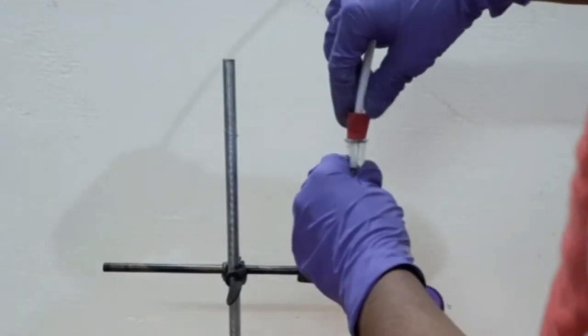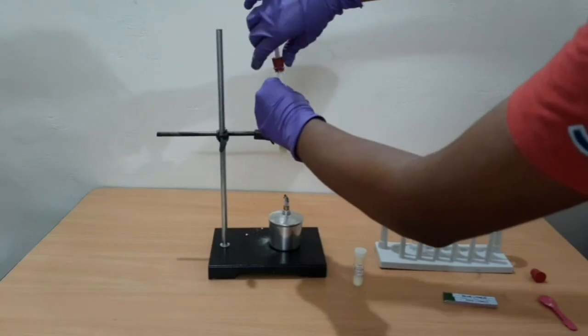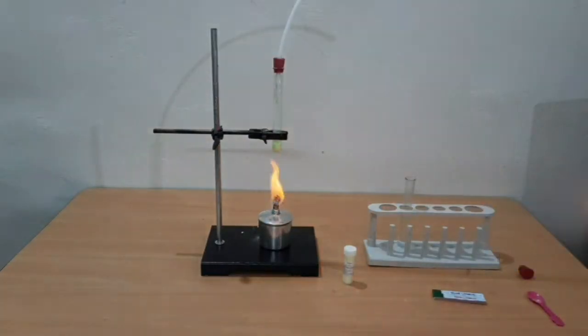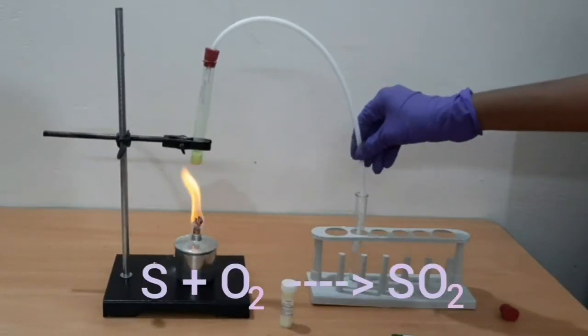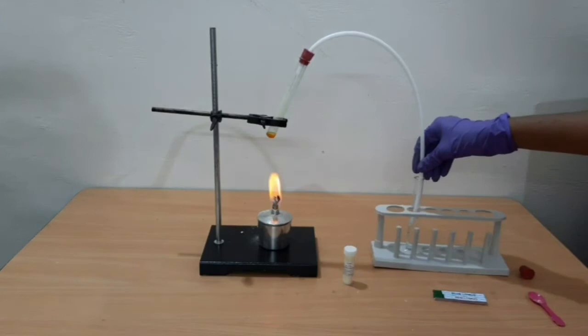Close the test tube containing sulfur powder with a cork fitted with the rubber tube. Heat the sulfur powder over a spirit lamp. Sulfur when heated combines with oxygen to form sulfur dioxide. Observe the fumes of the sulfur dioxide coming out of the test tube.